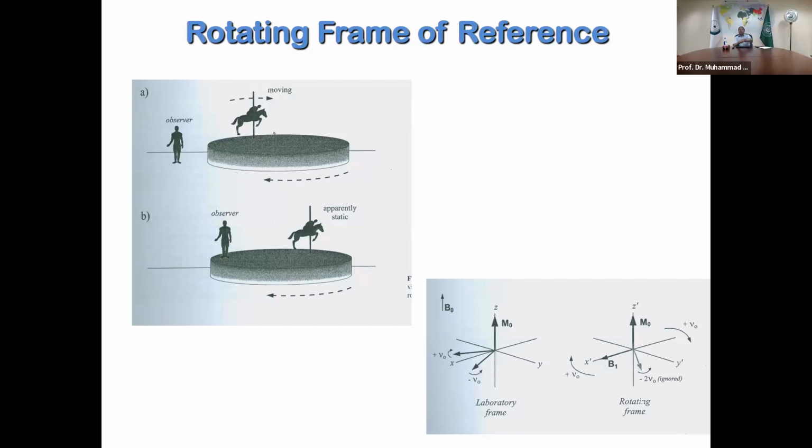But as you know, in reality, you cannot really move the detector with the speed of light. So what actually happens is a simple mathematical operation: when you are recording the FID, you subtract the operating frequency of the NMR spectrometer. That becomes absolutely easy because the mathematics is now conducted on a few hertz of difference rather than megahertz of difference. So it makes life easy.